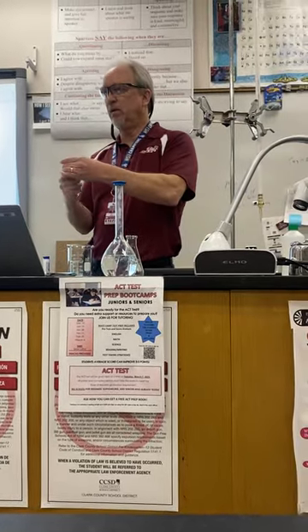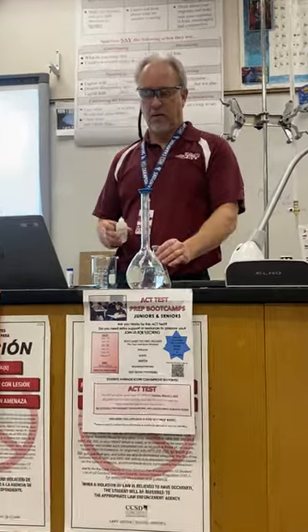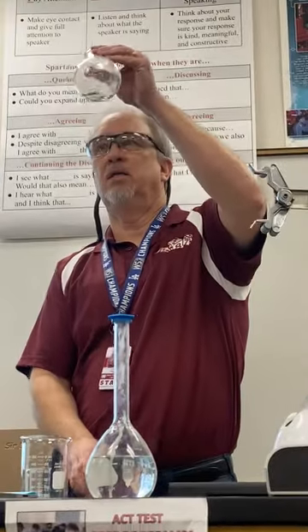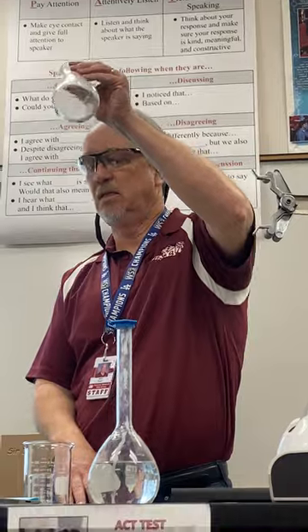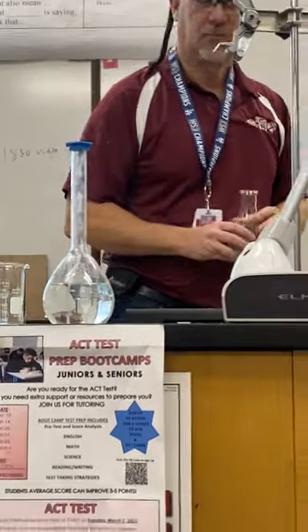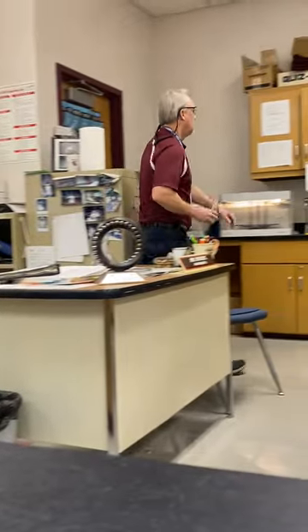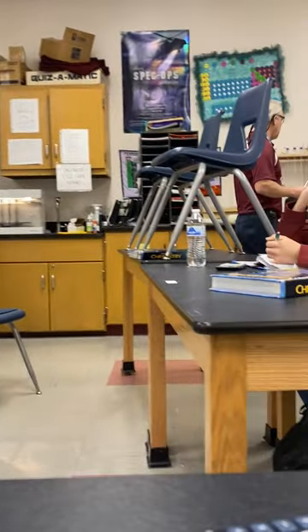I could also take some phenolphthalein. I'll have that available to you. Put a drop or two in there. Notice it stayed clear, so I know that is an acid, not a base. Make sure all my equipment's clean to start with.